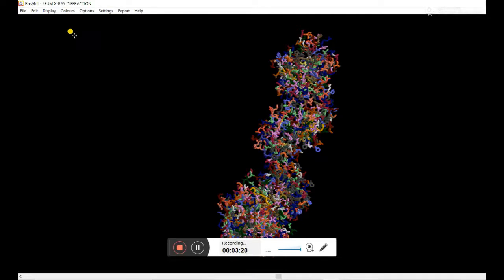Now, the places where there is yellow color indicate that those regions are made up of amino acids like cysteine and methionine. That is, different amino acids are being given different colors based upon their properties. Where you have bright red, it indicates aspartic acid and glutamic acid are there. It's not that evident here.